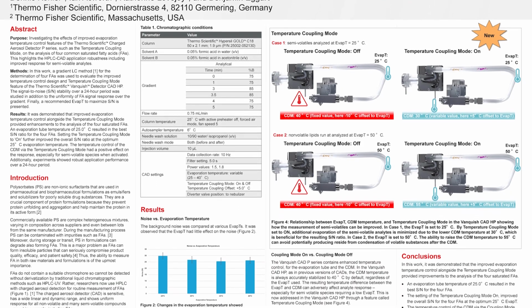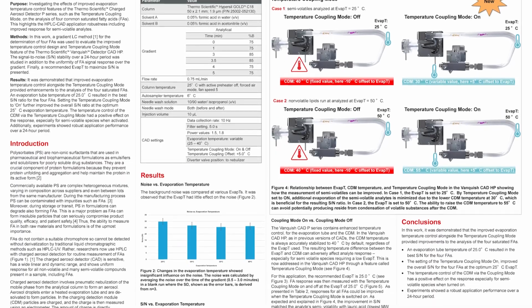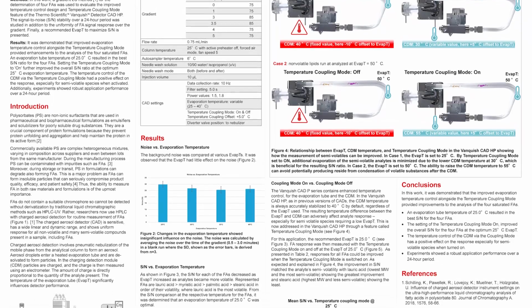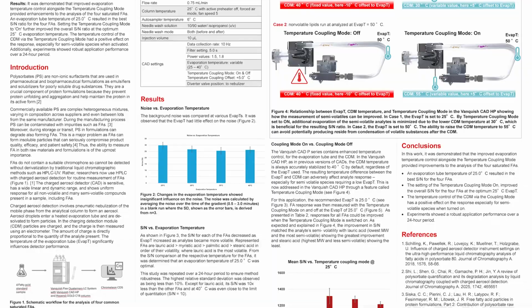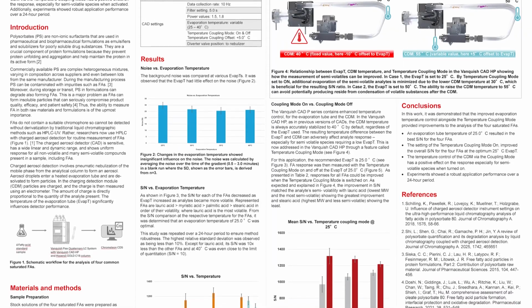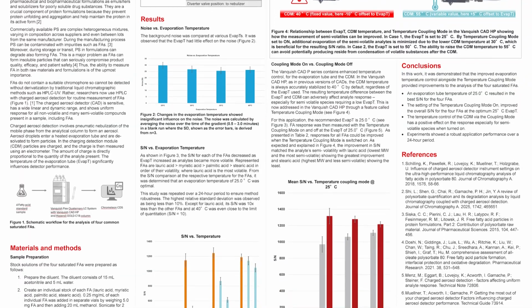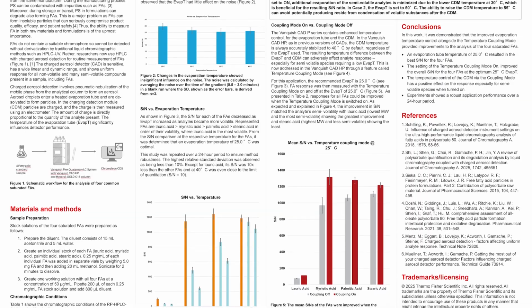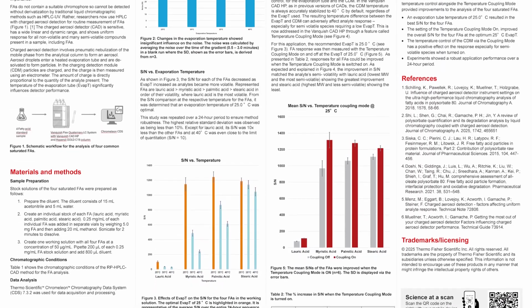If you're coming in with 70 degrees of hot gas phase or hot aerosol and you cool it down to 40 degrees, that might lead to problems, and the other way around as well. If you're coming in cool, hitting 40 degrees instantly, it might lead to evaporation effects. So the new feature we have is that we couple the evaporation tube to the CDM. Therefore our customers can decide, okay, let's make an example.